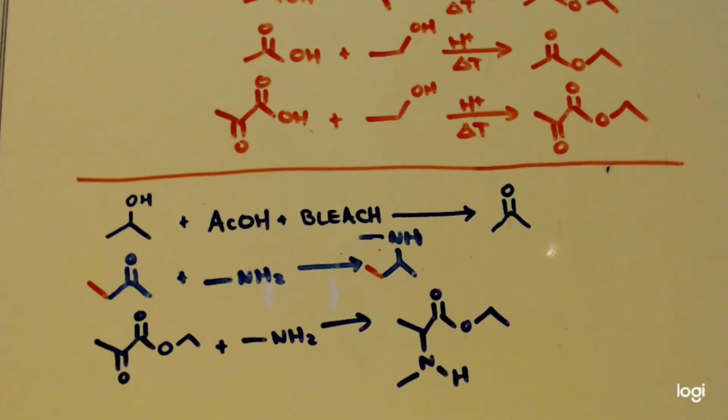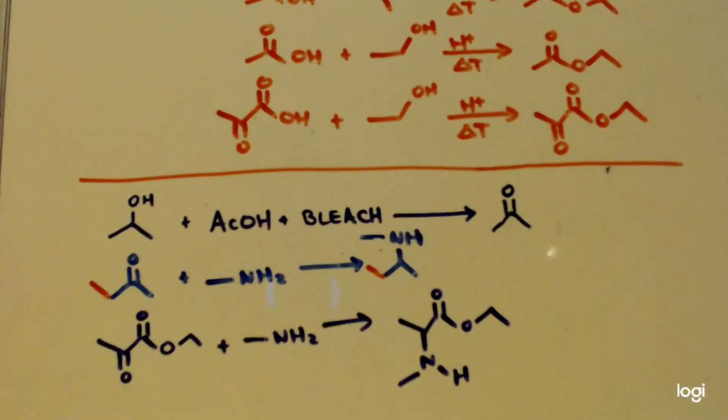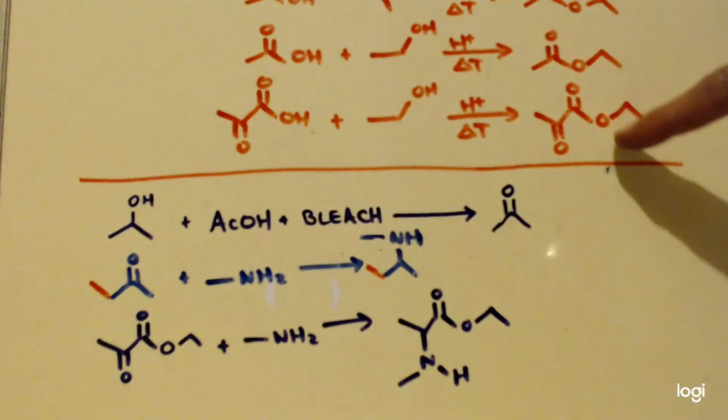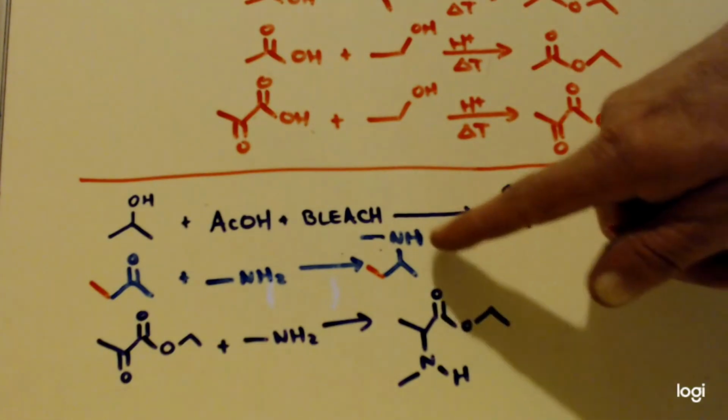And then, since I'm making methylamine, I want to try to add it to some carbonyl groups. So I'm going to add it to this ester that we made in the last thing up here. And this one right here.